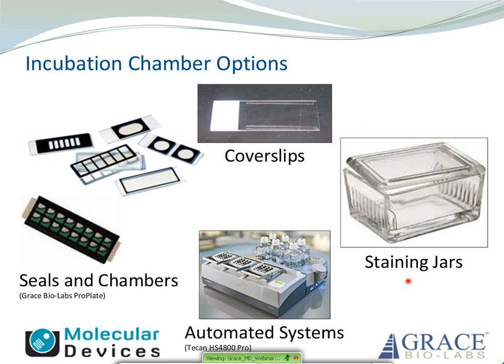Staining jars allow for ample mixing and are excellent for slide washing, but are not ideal for incubations due to the excessive sample dilution. Automated systems, such as the one shown here, allow for excellent control of incubations and washing, but at a premium cost. Alternatively, there are various adhesive-based seals and clip-on chambers, which also provide active mixing and allow for small sample requirements to be met at a low cost. So in the next slide, I'll show the importance of active mixing during incubations and its impact on data variability.